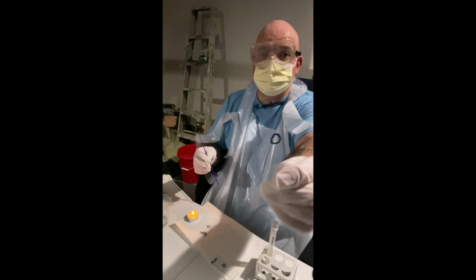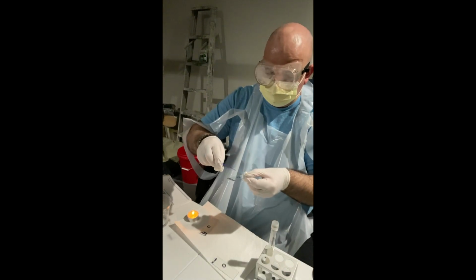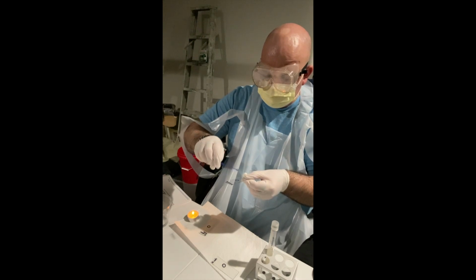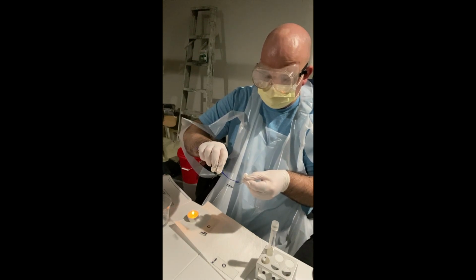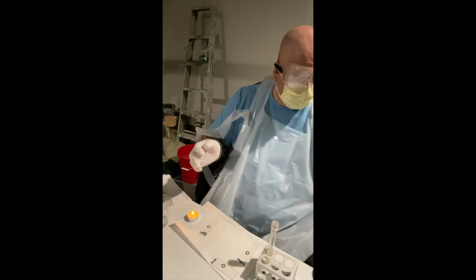Alright. So my S. epidermis slide. Okay, and I'll just place the inoculation loop right on the circle I drew. Both sides, make sure I get a good deposit. This will be set aside to dry, and then again, this is going to go into my bleach down here.